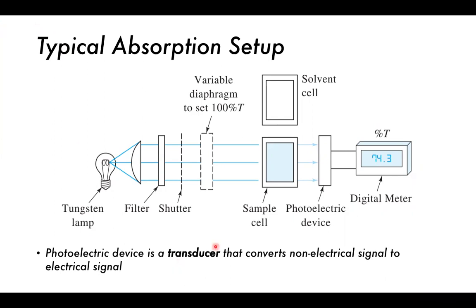So that's an important thing that we talked about before in the previous sessions, this idea of us recording or measuring the changes in electrical current or potential that flows through a circuit, as opposed to directly measuring, for example, the light absorbed. It's all by inference and indirect measurement, because it's much easier for us to measure electricity flowing through a circuit than it is the actual amount of light absorbed by some sort of photoelectric device. So we design it in such a way that it's easier for us to manipulate.